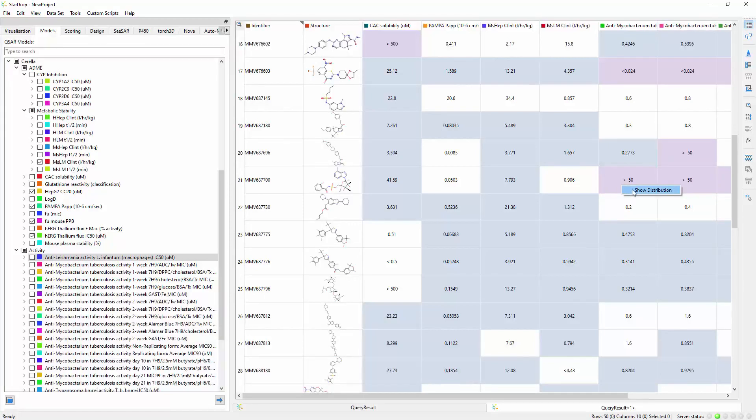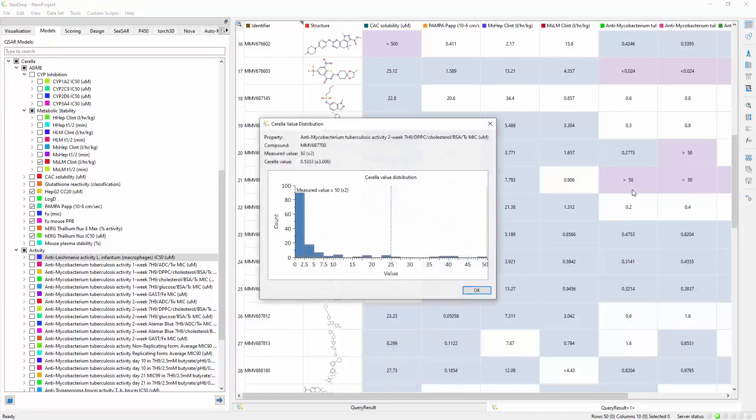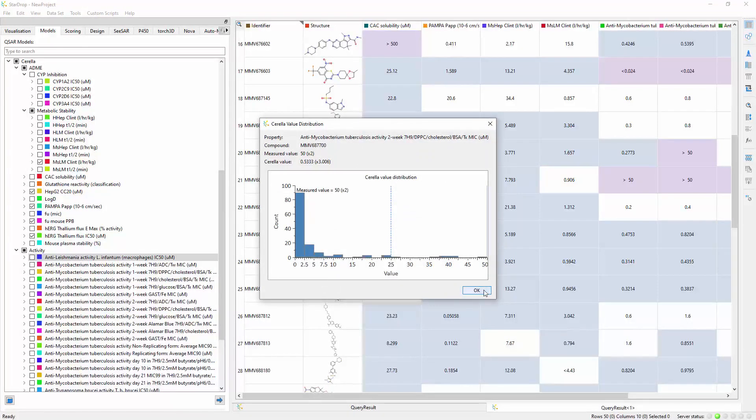Comparing this measured value with the predicted probability distribution suggests it would be valuable to retest this compound. It's likely to be active.